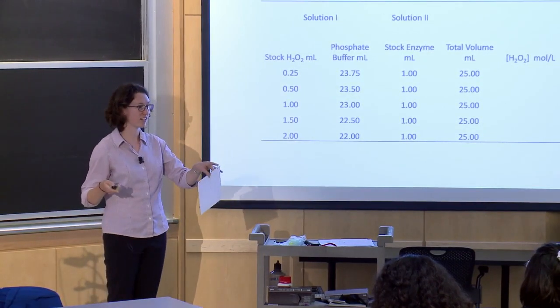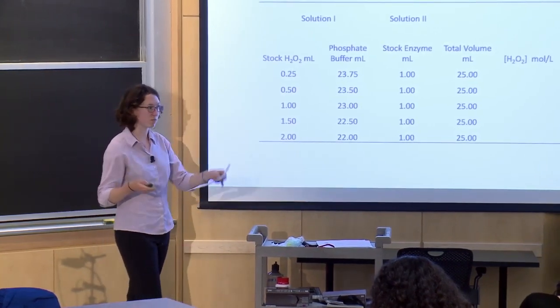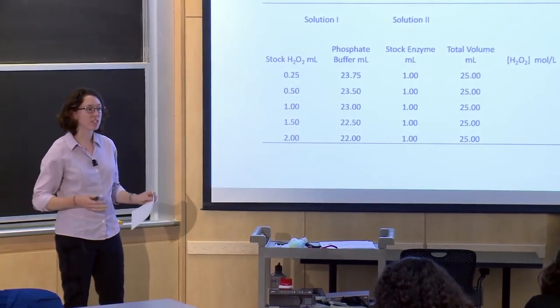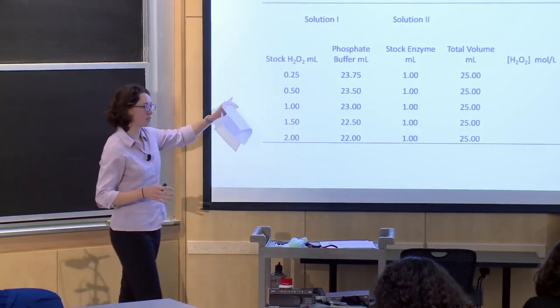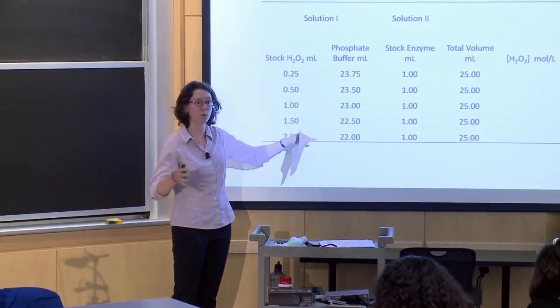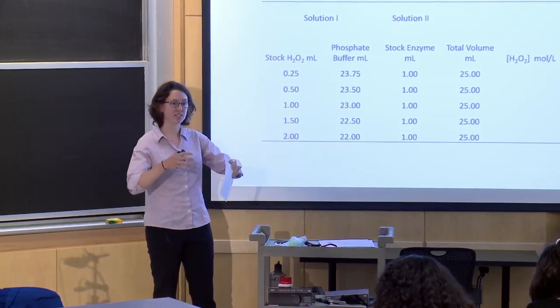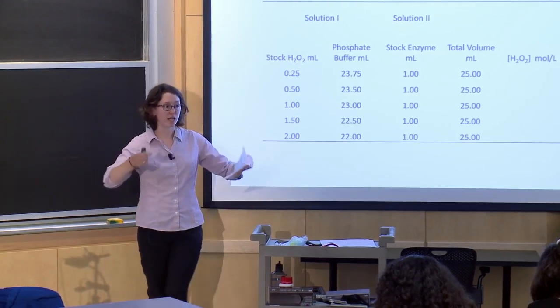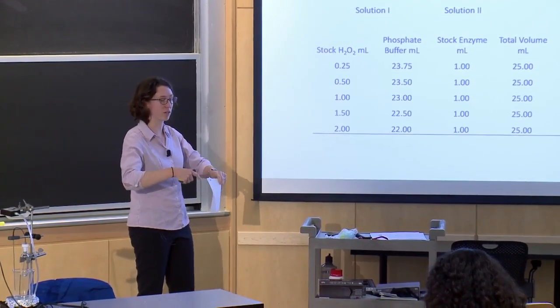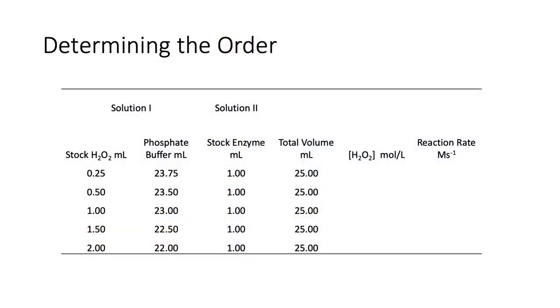Maybe it denatures the enzyme? Yeah, so enzymes are most functional at a set pH. So the pH of your body is around 7, so we want to keep the pH of our reaction somewhere around our physiological pH. So our buffer is going to be set to pH 6.8, which is going to help make sure that the enzyme is in its active state. It is not denatured. If you change the pH too much, you'll change the protonation state of the different parts of the protein, and it can fall apart. So we want to make sure that this is happening at the correct pH.